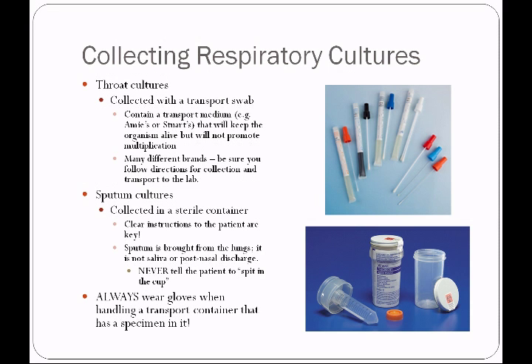Always wear gloves when handling the transport container that has a specimen in it. You never know if the patient has missed when they brought up the sputum and delivered it into the container.